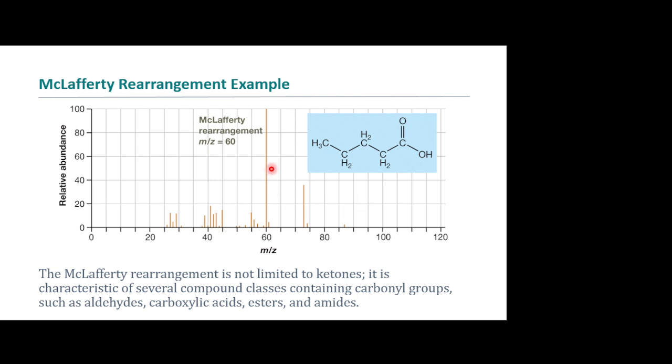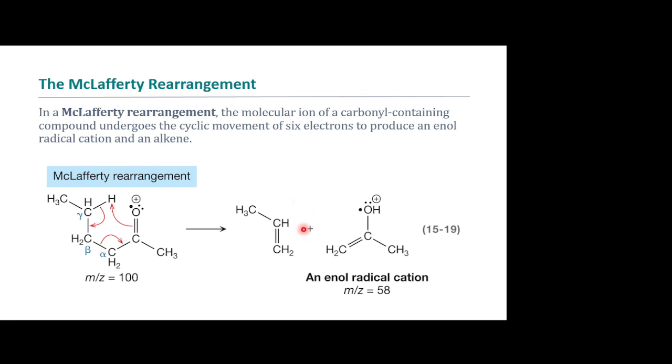Okay. And again, whenever you do these maths, the numbers you want to keep in the back of your head is how much is a CH3 being lost? 15, right? Okay. CH2 being lost is 14, exactly. Okay. In this case right here, because we're forming this double bond right here, we're always going to end up with a CH as well. Okay. And so instead of getting the 13 plus multiples of CH2, which would give you an odd number, you always end up with an even number, or a number that'd be one less than the other, right?